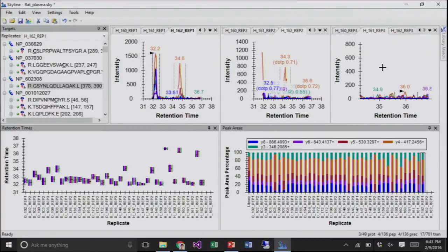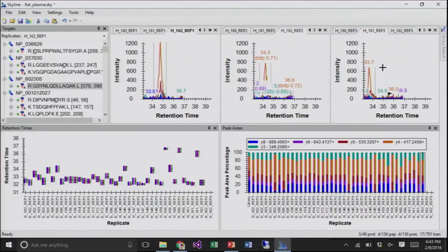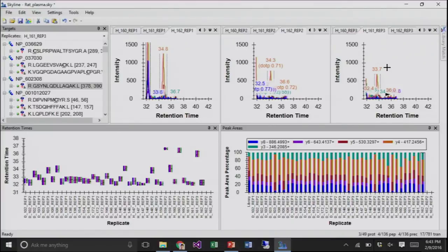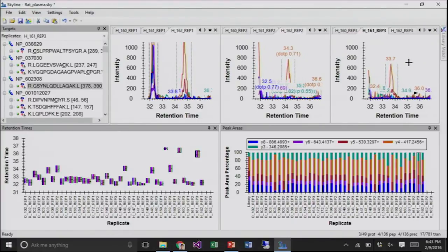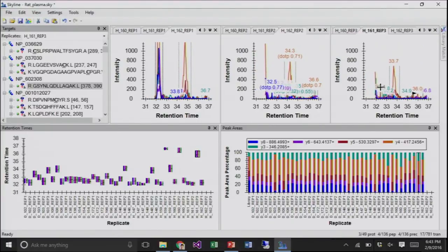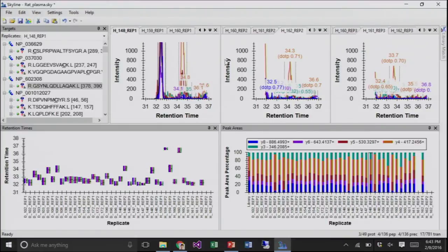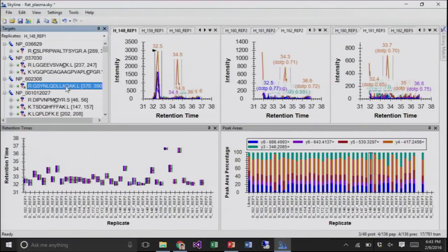Okay. Well, I guess I have to scroll wheel it. So yeah, it's picked something. This time it didn't even pick our thing at 37, and here's our other peak over here. And so we can go auto zoom, actually just right click, remove peak. I'm going to switch out of here because I got in a weird zoom state.